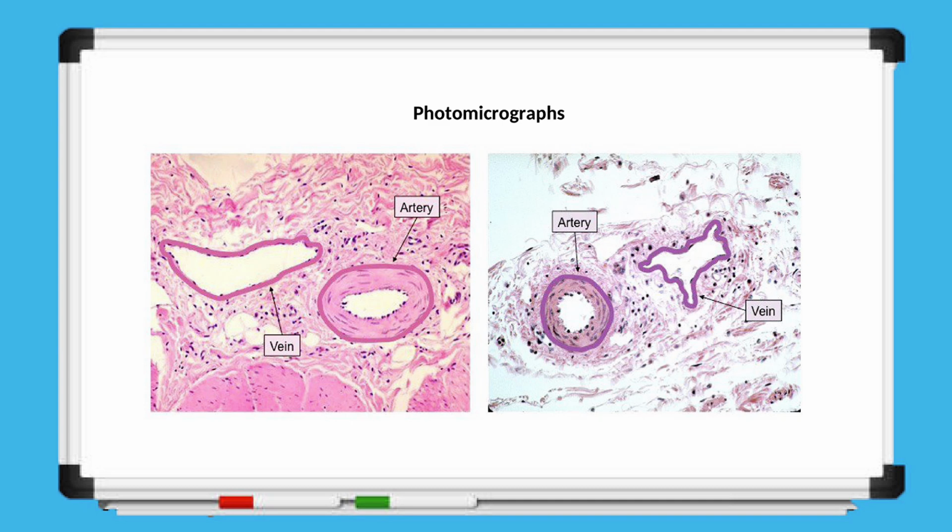The lumen, or the internal space through which blood flows, is relatively small and maintains a more circular shape compared to the vein. This structure helps the artery withstand the high pressure of blood pumped directly from the heart. In contrast, the vein has a much thinner wall. Its lumen is generally larger and can appear irregularly shaped or collapsed in tissue sections. The thinner, less rigid walls make veins more flexible but less able to resist high pressure.